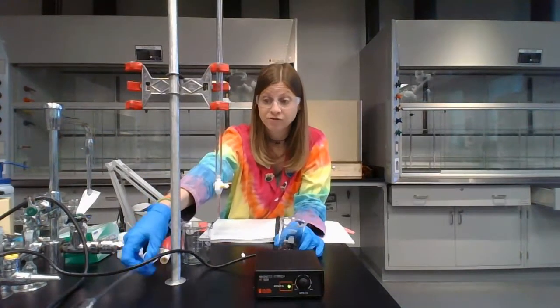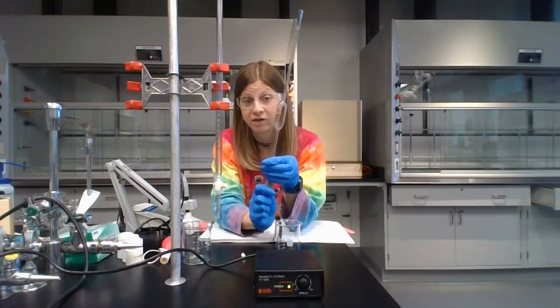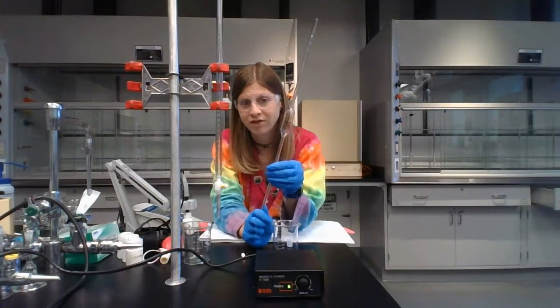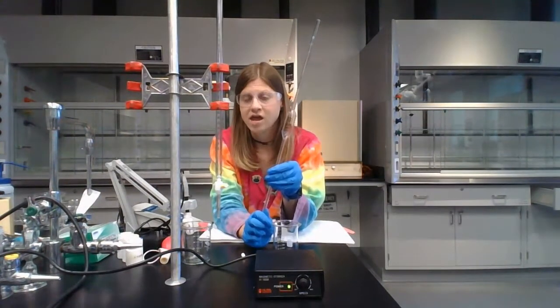And you can do the pipetting for trials 1, 2, and 3 all at once. You need to accurately add 25 milliliters of the unknown acid. So you'll be using a 25 milliliter volumetric pipette. Now, be very careful with these buddies.